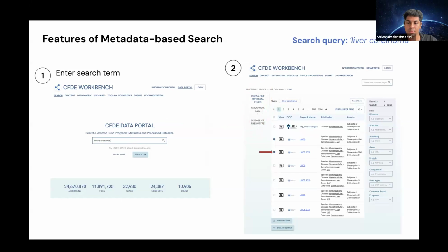And you can also select individual records here shown in this neatly organized results page, which is also paginated based on your requirement and convenience. And you can choose individual records and download them into a JSON format as shown here.